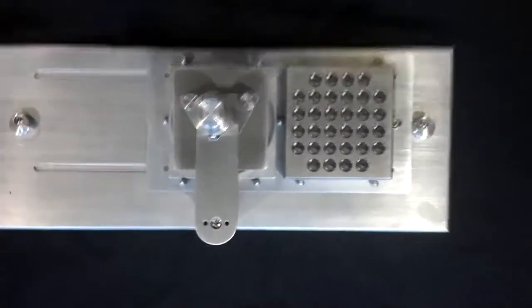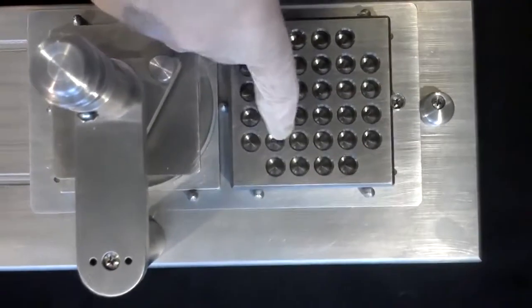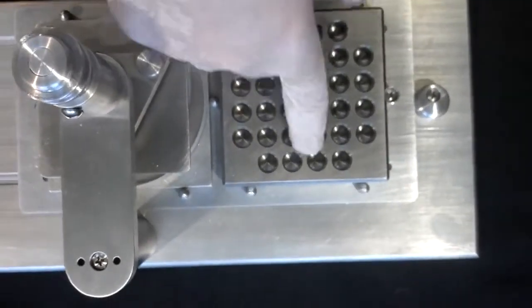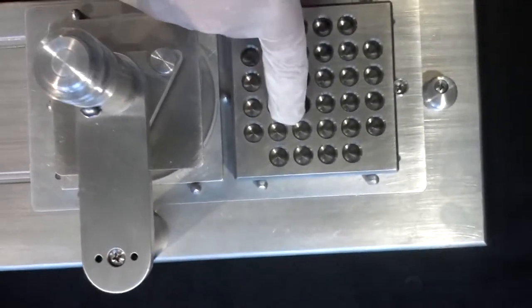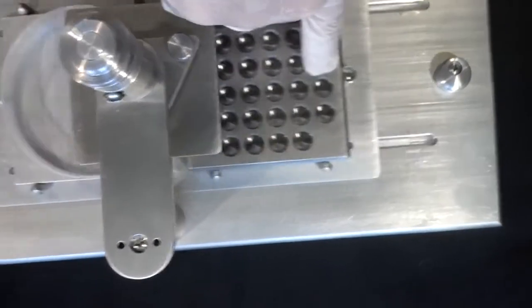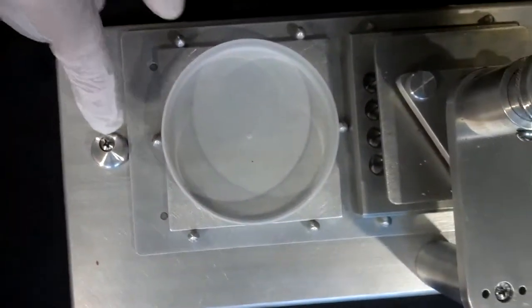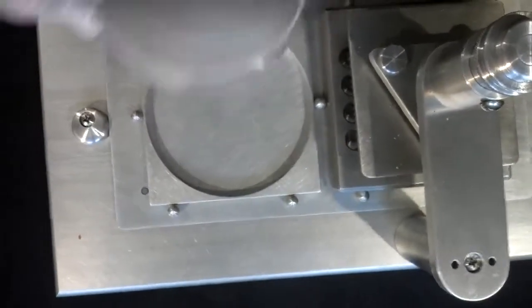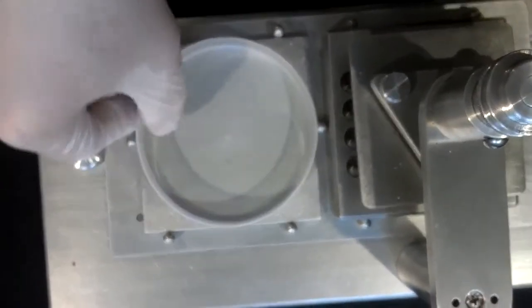Very simple to use. You place your inocula into the reservoirs. You place your petri dish into the slot provided.